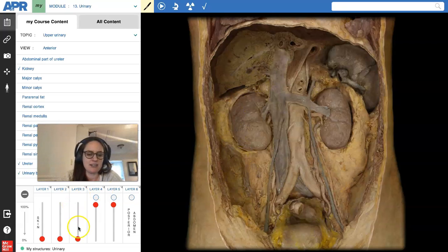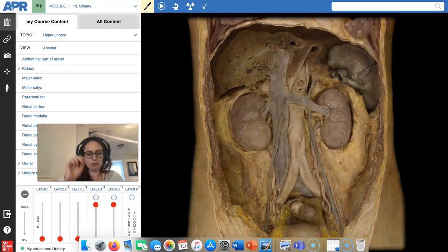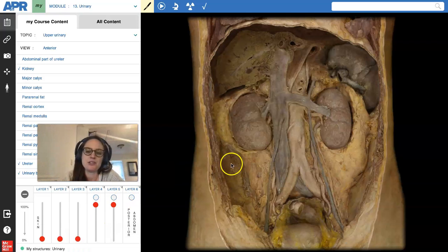So in order to dissect this far, they really didn't bother portraying it, but you actually have to get rid of another membrane to get to this. So here you have your right and left kidney. Typically, that right kidney is going to be a little bit lower than the left kidney. This doesn't show that very well because you got the liver on this side, and that tends to push that kidney a little bit further down. Veins are almost always superficial compared to arteries. So that's the vena cava, and those are renal veins, and that's the abdominal aorta, and that makes that the renal arteries, so deeper structures.